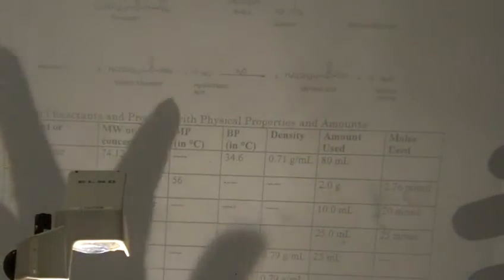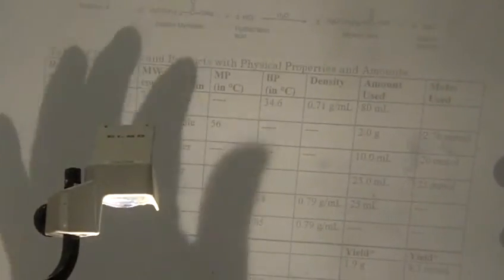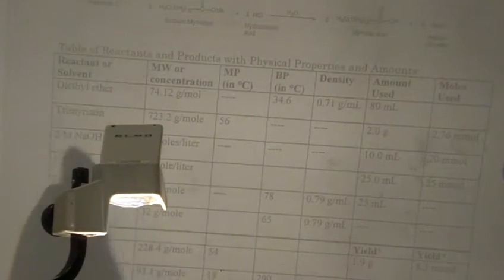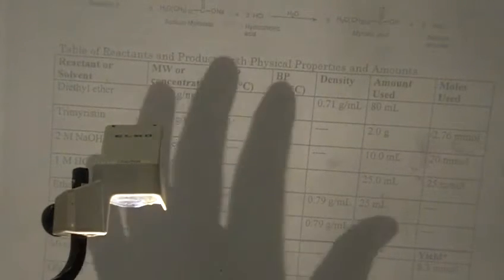The other parts of the pre-lab, you've got your table of reagents as well as products, so you want to make sure that that completely takes care of all the chemicals that are going to be used or produced in your experiment, so kind of double check your table, make sure that that is all taken care of. We've talked about the flow diagrams, so then things you need to add.